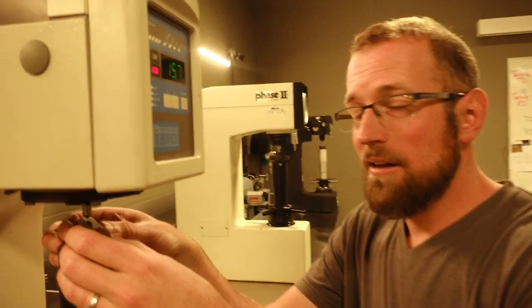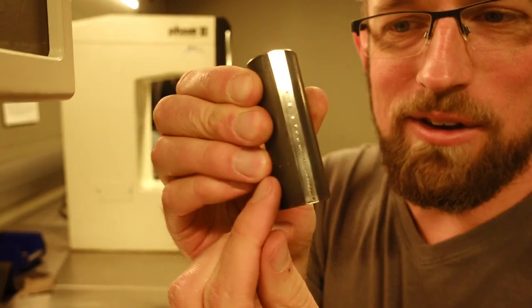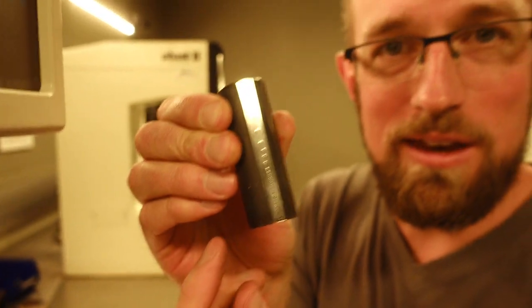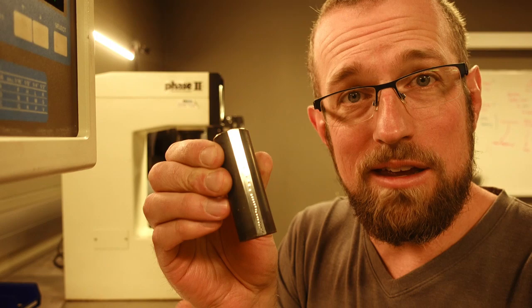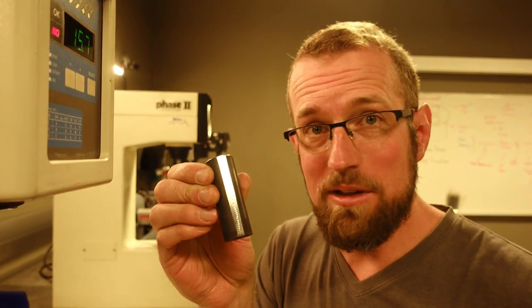What is our final number? That's our final number at 15.7 HRC. As you can see our series of hardness indents there, one sixteenth of an inch for the first inch, a little more spaced out for the next inch after that. But it gave us plenty of data that we should be able to put into a hardenability curve.